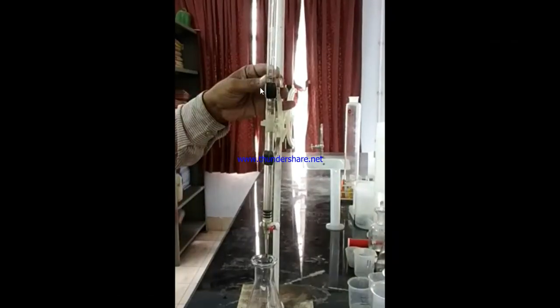Then what is the quantity of sodium thiosulfate that is consumed? Final volume minus initial volume will give us the quantity of sodium thiosulfate. Then we will first find out the DO, dissolved oxygen. How will we find out? By ml of titrant Na2S2O3, कितना ml consume हुआ है, that is final volume minus initial volume, multiplied by normality of sodium thiosulfate, that is 0.025, multiplied by 8, which is the equivalent weight of oxygen.